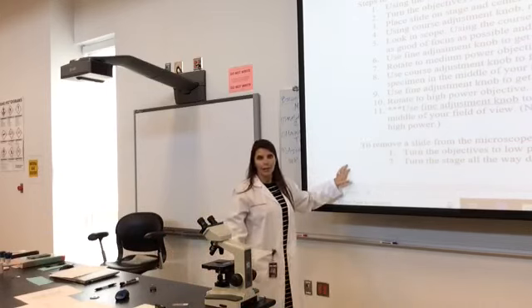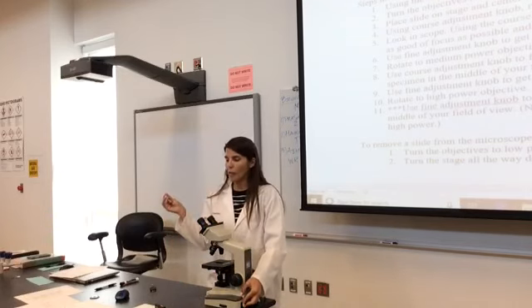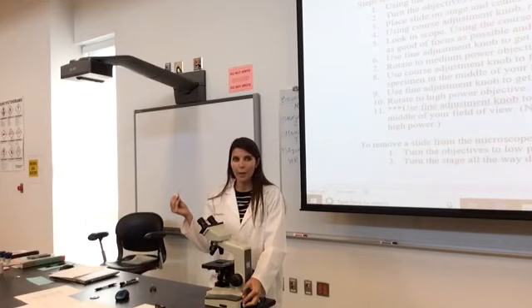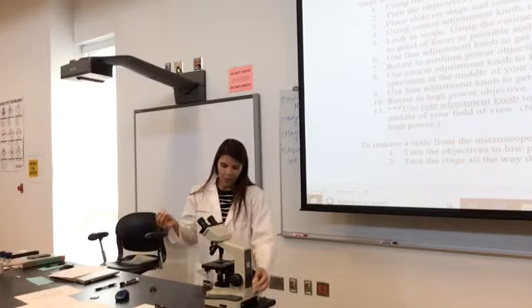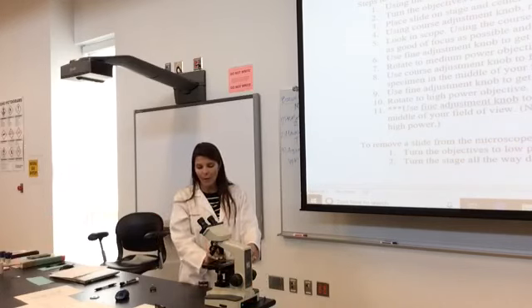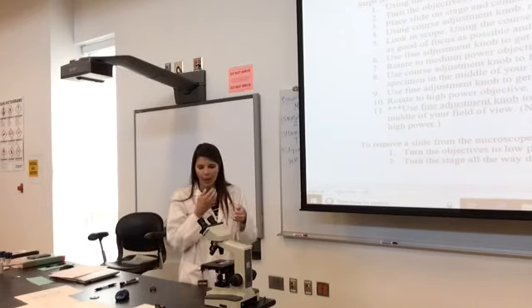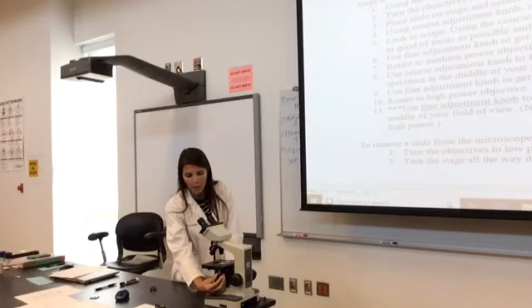Okay? I walk up. It's my turn. I'm going to focus Volvox, which is algae having babies. You'll be excited. I'm going to turn my microscope slide on. I'm going to take my slide, open my mechanical stage, place it in that top right corner, and release the claw. It has now hugged my slide. I am going to use my stage adjustment knobs on the right side to line my specimen up over my condenser.